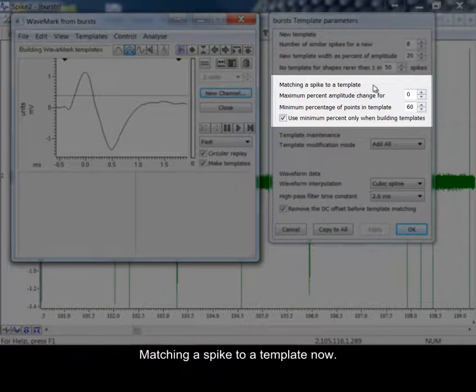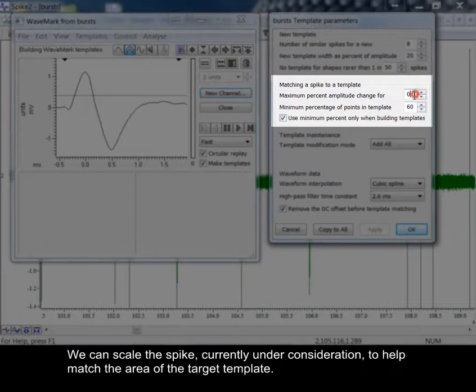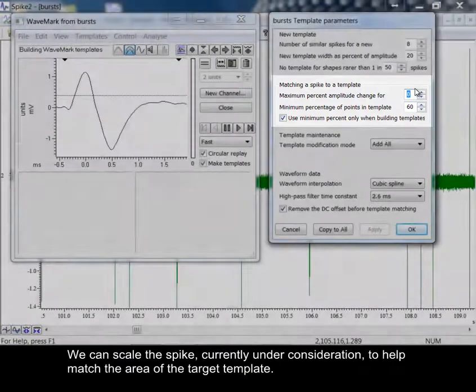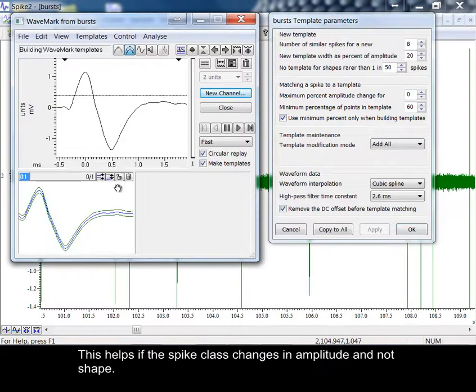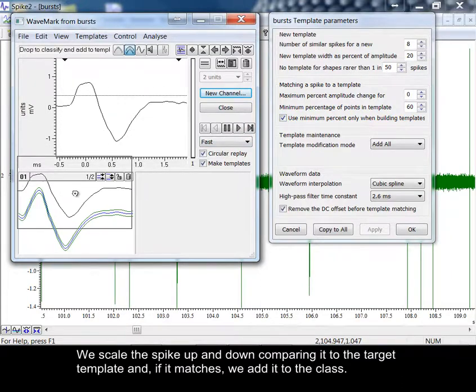Matching a spike to a template now. We can scale the spike currently under consideration to help match the area of the target template. This helps if the spike class changes in amplitude and not shape. We scale the spike up and down, comparing it to the target template, and if it matches, we add it to the class.